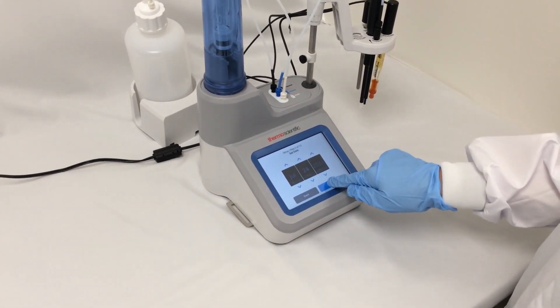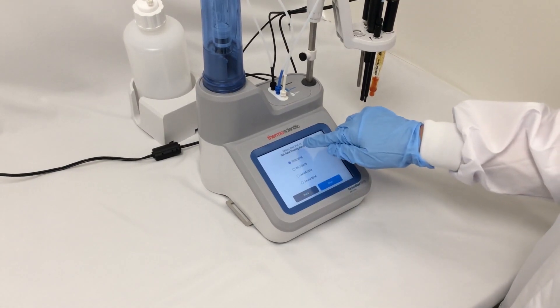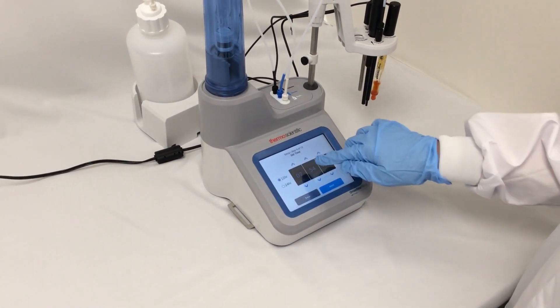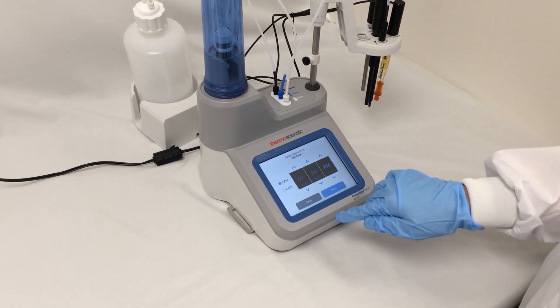I'm going to set today's date and select my date format. I actually like month, day, year. Then I'll select my time — I can do it in 12 or 24 hours.